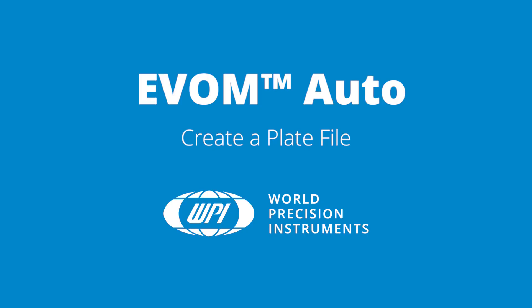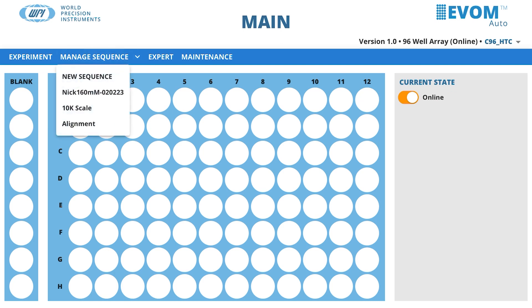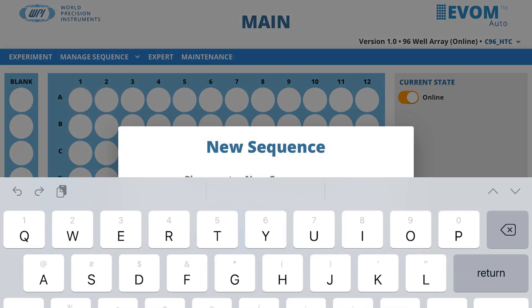Create a plate file. To create a measurement sequence, select the Manage Sequence menu. A list of the existing sequences displays, and you may open and edit any existing sequence or select New Sequence to create a new one. If you select New Sequence, a pop-up allows you to name the sequence.